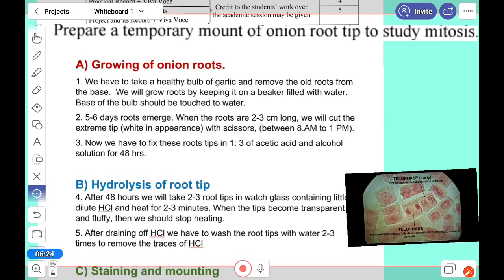First, we have to take one healthy bulb. Here the garlic we have taken, and old roots you have to remove. We will grow the root by keeping it in a beaker filled with water. We'll put toothpicks on the sides and place it in such a way that it touches the water. The bulb will touch. Five to six days, the root emerges.